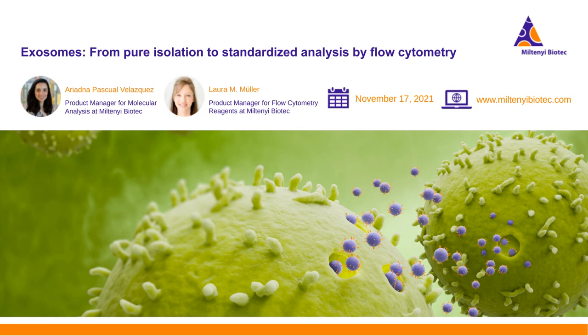Thank you so much. A final question that we have time for. Are there any special requirements on the flow cytometer to be used for the Multiplex assay? So there are no special requirements. Most of the flow cytometers can be used to analyze the Multiplex assay.